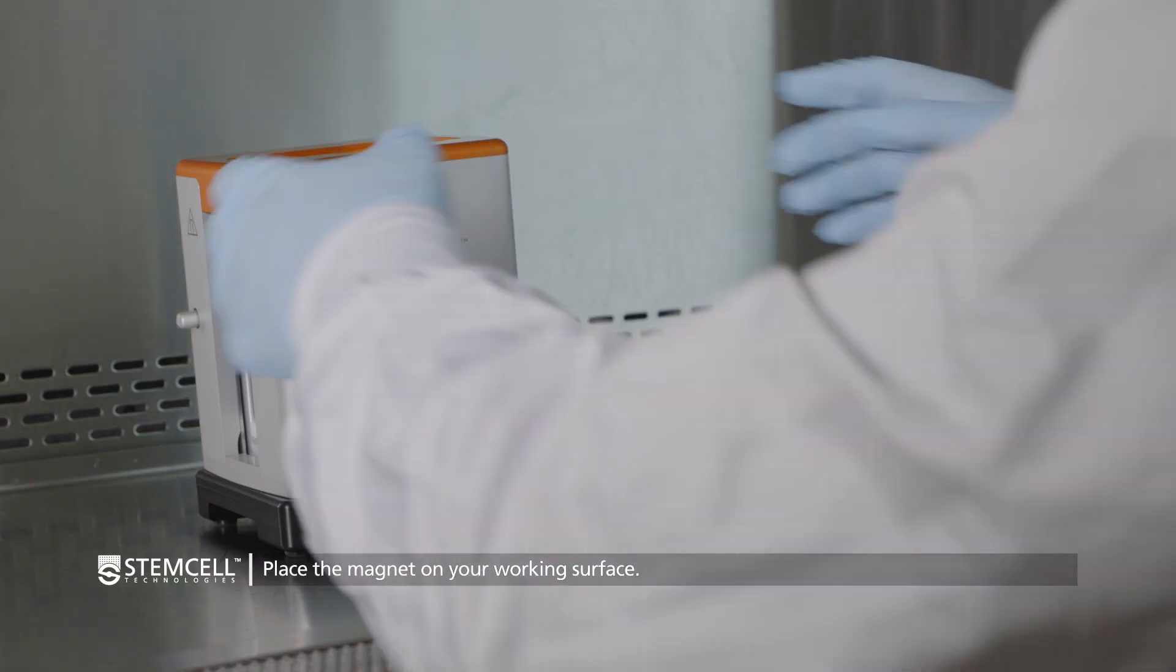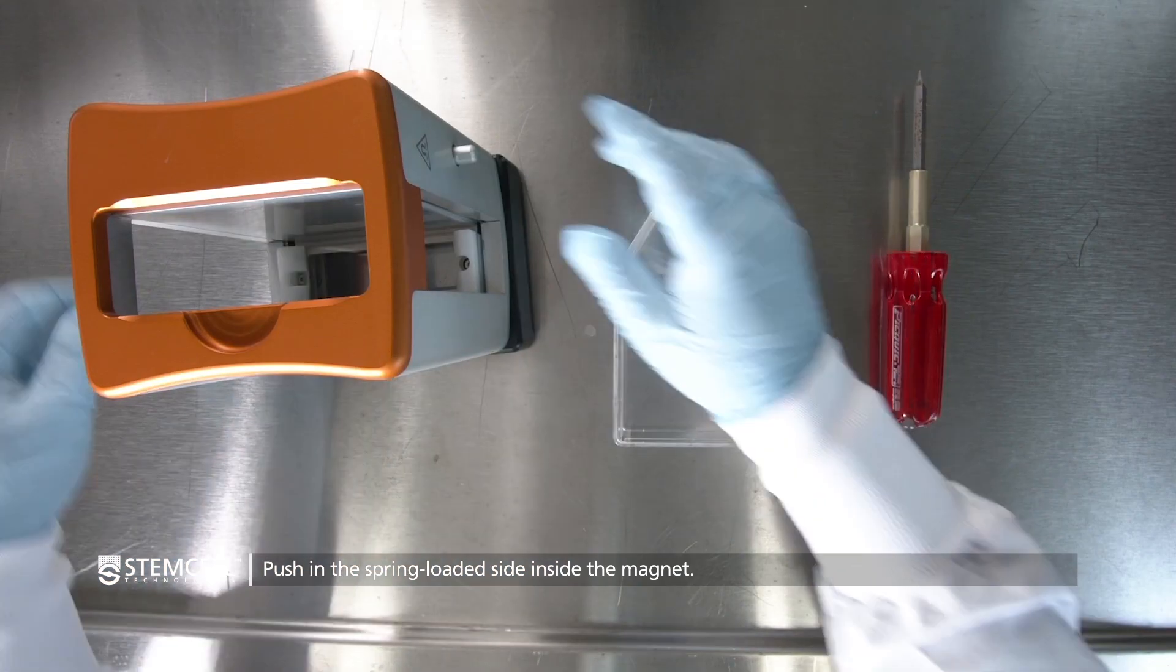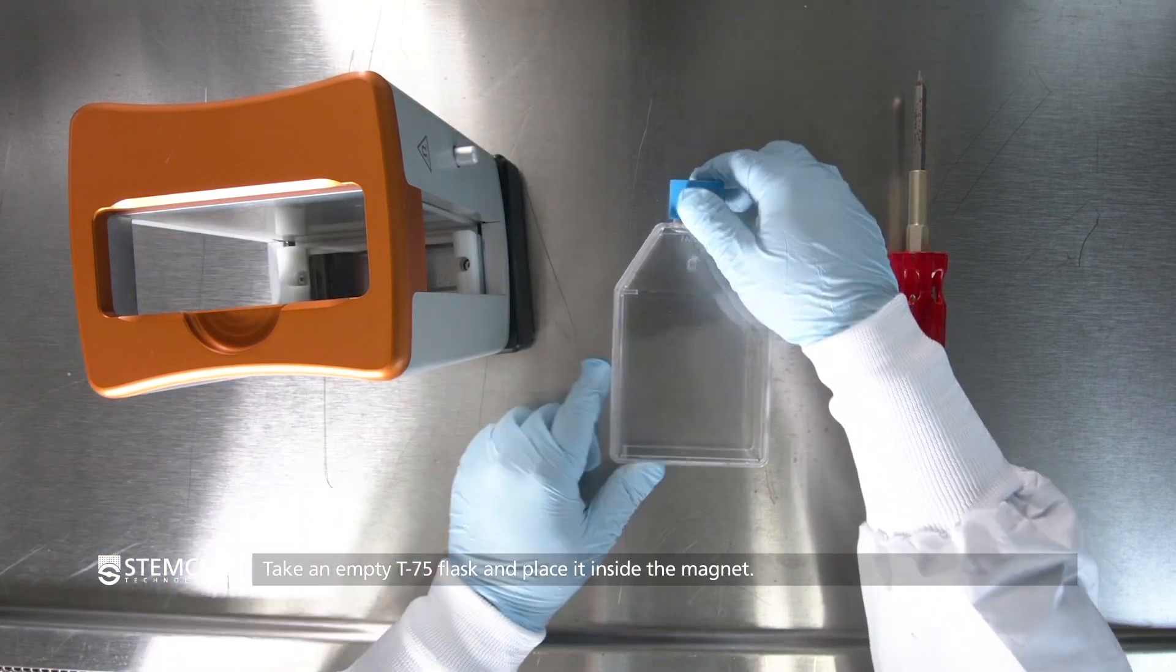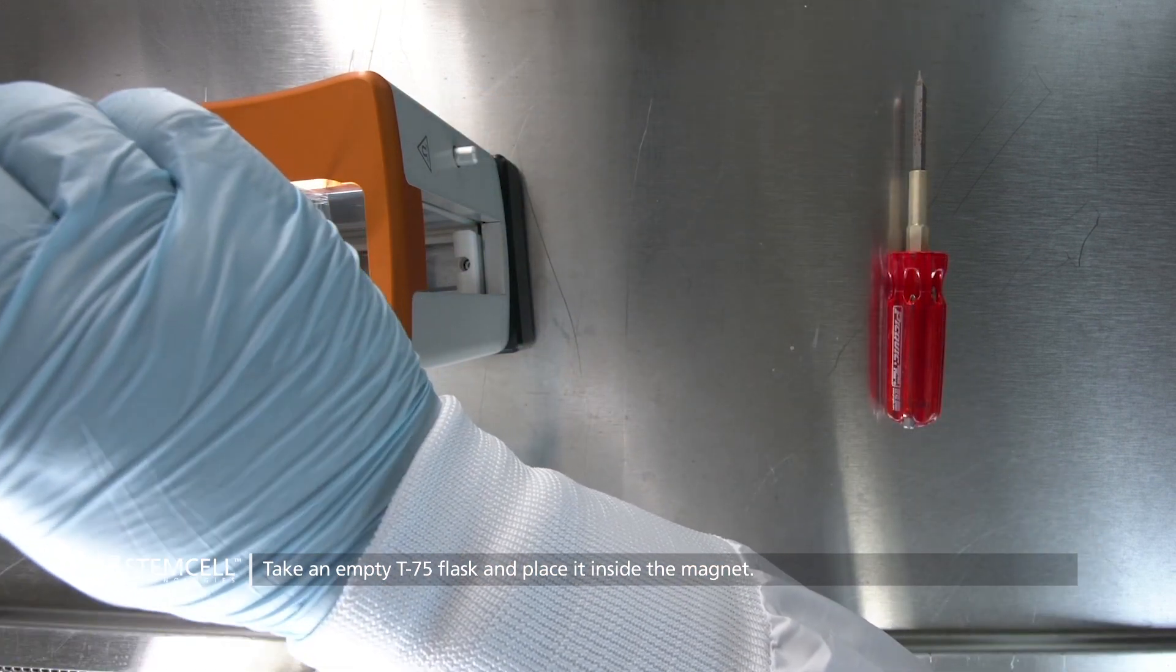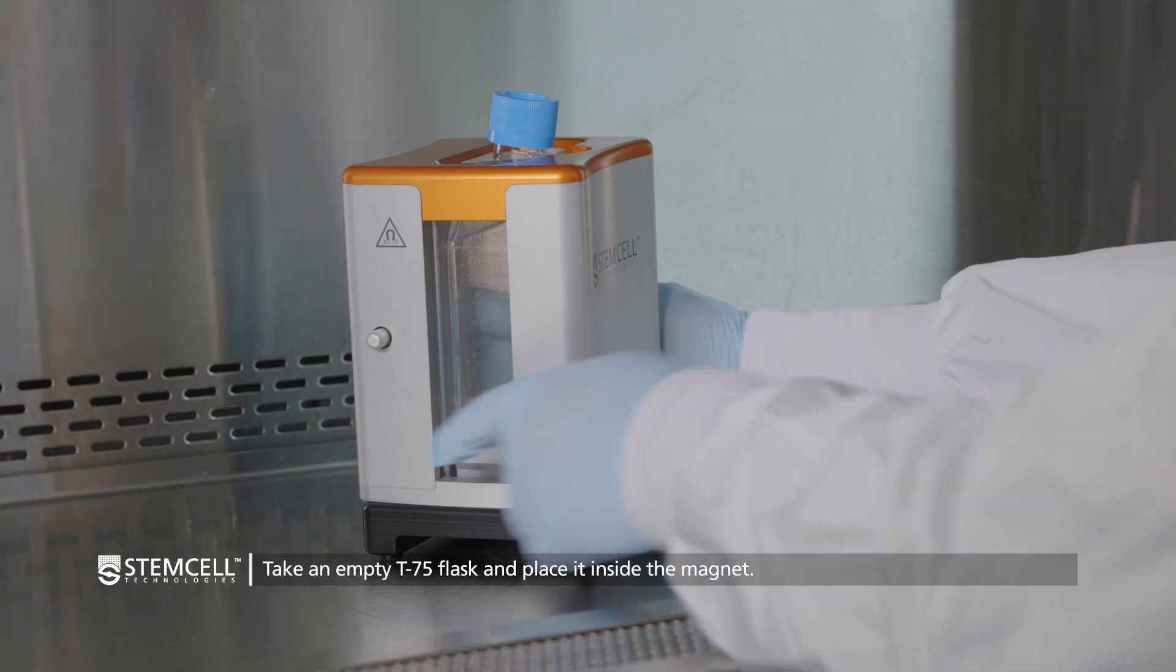First, place the magnet on your working surface and push in the spring-loaded side inside the magnet. Then, take an empty T75 flask and place it inside the magnet.